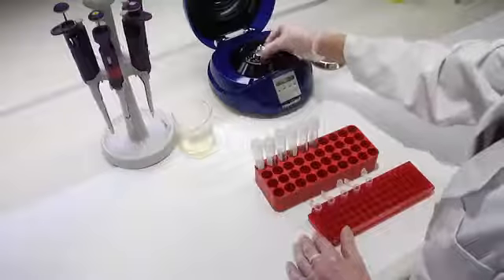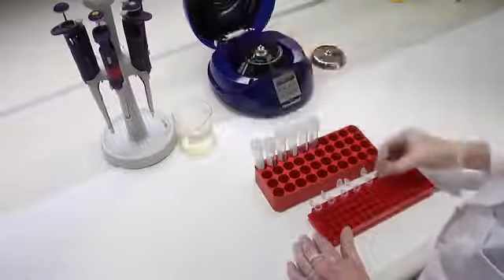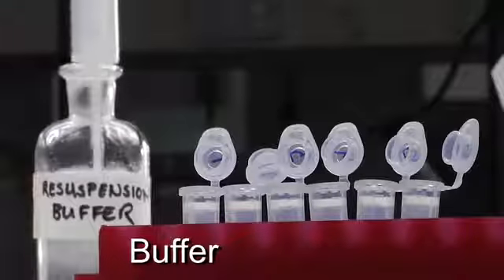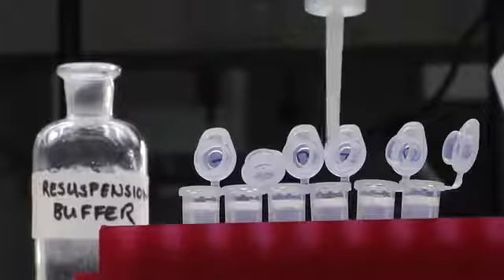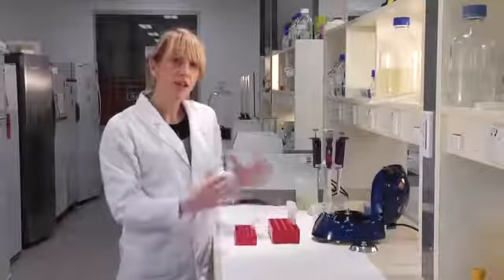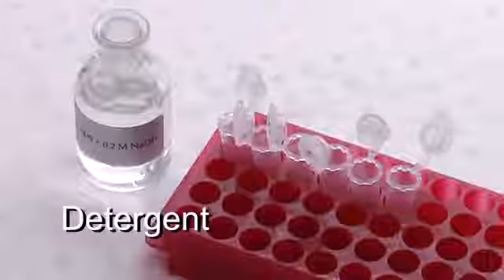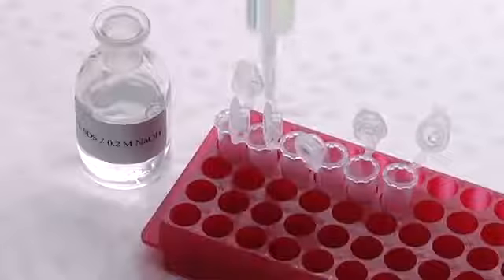Now our bacterial cells have formed a pellet, we can throw away the culture supernatant. We then resuspend each bacterial pellet in a consistent volume of buffer. And the next thing we need to do is break open the cells. And we do that using detergent at a high pH. The detergent breaks down the lipid cell wall to release the cell contents.